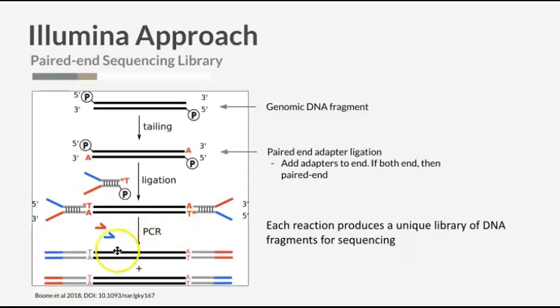But because in pair end you have two sets of reads covering the same fragment, we'll call this read 1 and this read 2. What's going to happen is that you'll have elongation that goes both this way as well as this way. And so later when we do our alignment, you'll see that if you have both ends, you're more likely to cover what's in the middle. So keep that in the back of your mind, and let's follow up on that when we have a picture. It'll be a little easier to visualize in a later slide, and I'll point it out then.